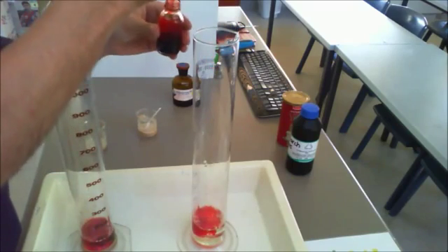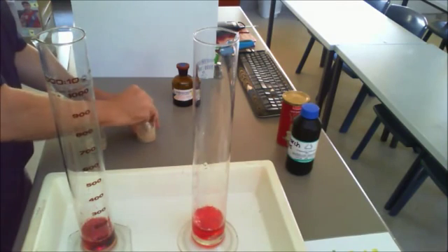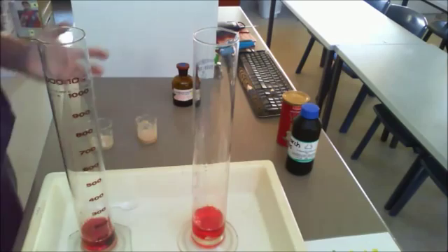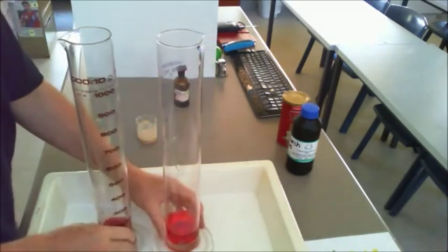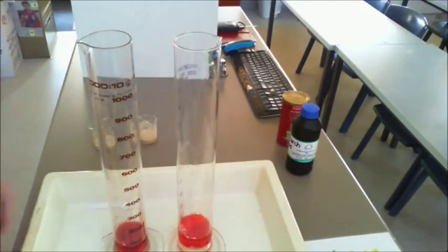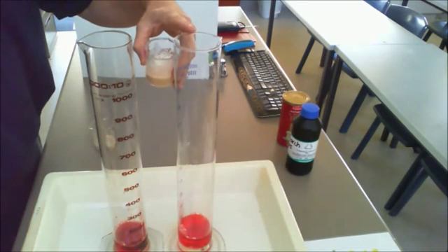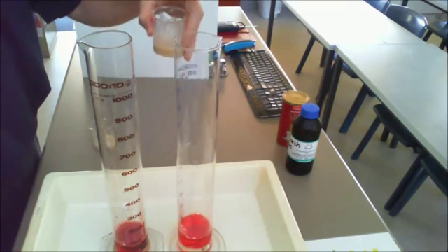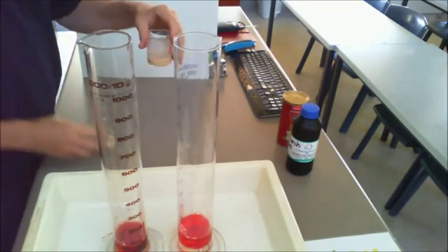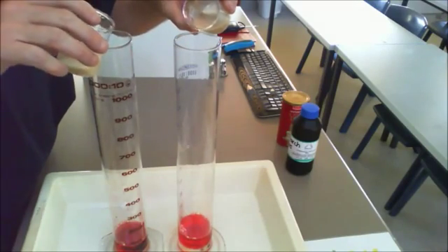Now I'm going to put both of the beakers of yeast in at the same time, and then the reaction is going to occur, and what we're looking for is which reaction is going to be the quickest. We'll place them a little bit closer together so we can see them through there. We'll take away the bottle. Into this measuring cylinder here, I'm going to put the full teaspoon of the catalyst, and into this one I'm going to put the half. So here we go.